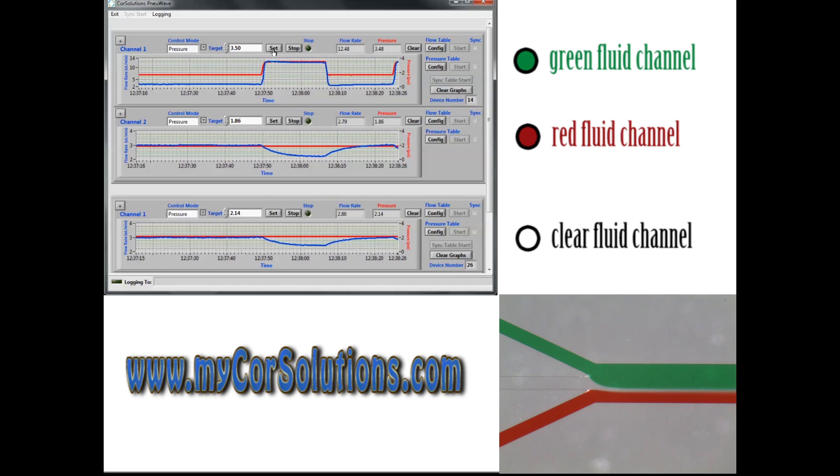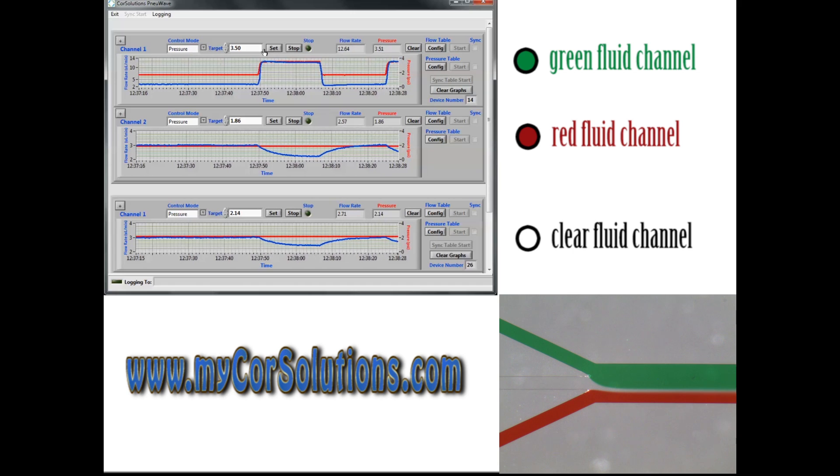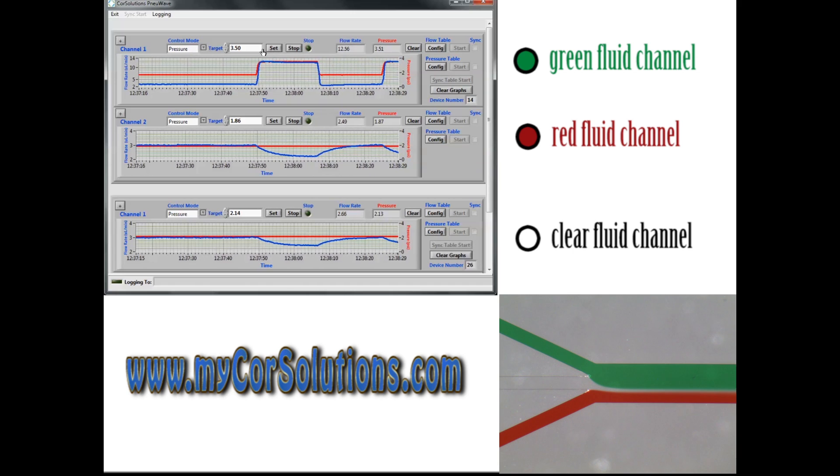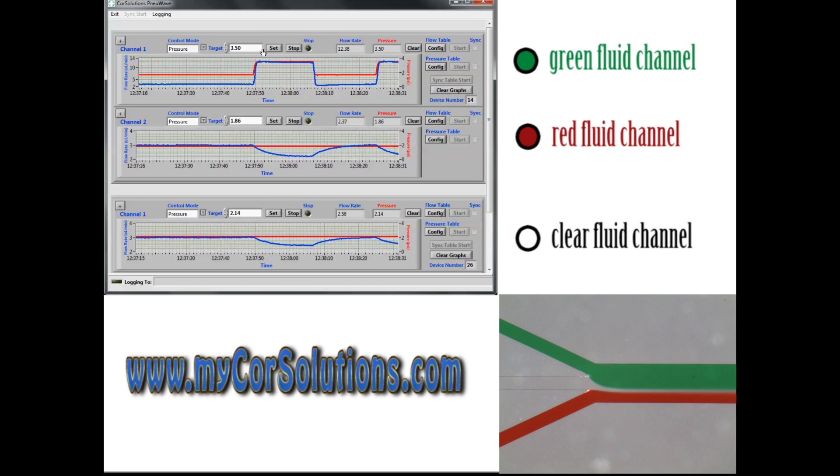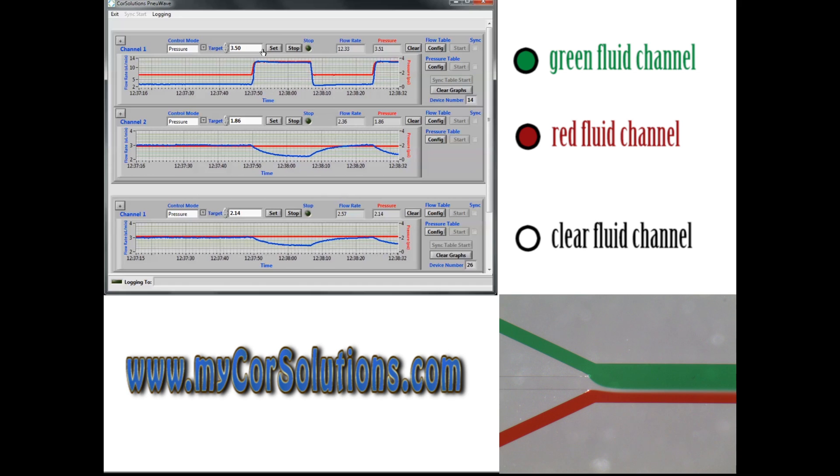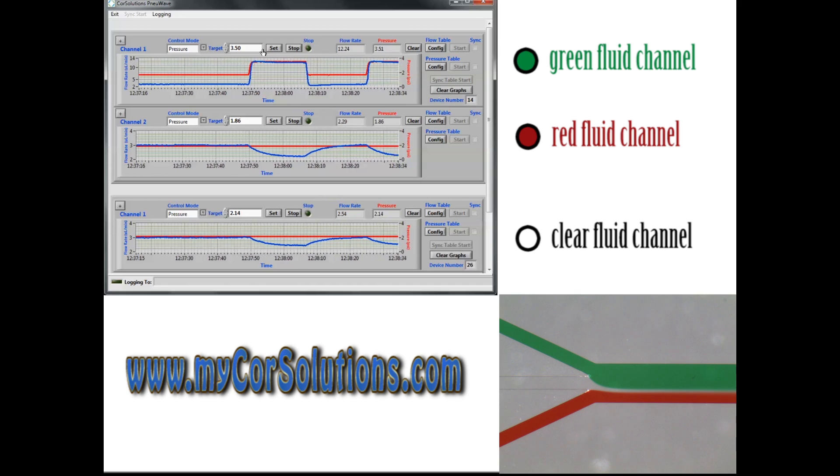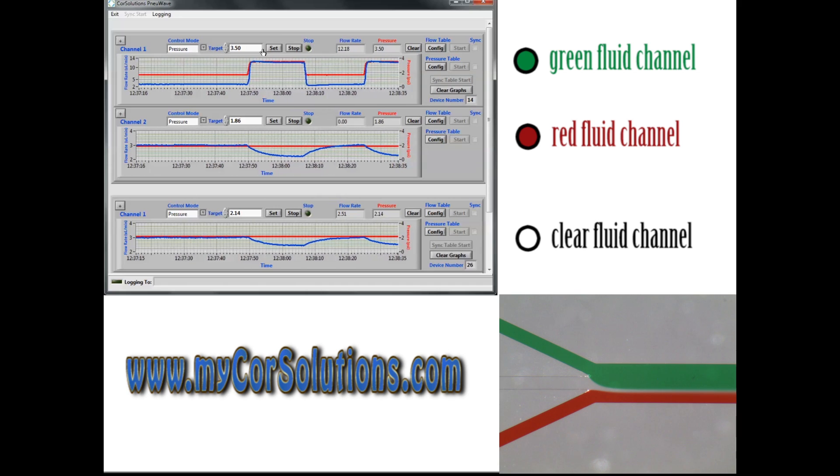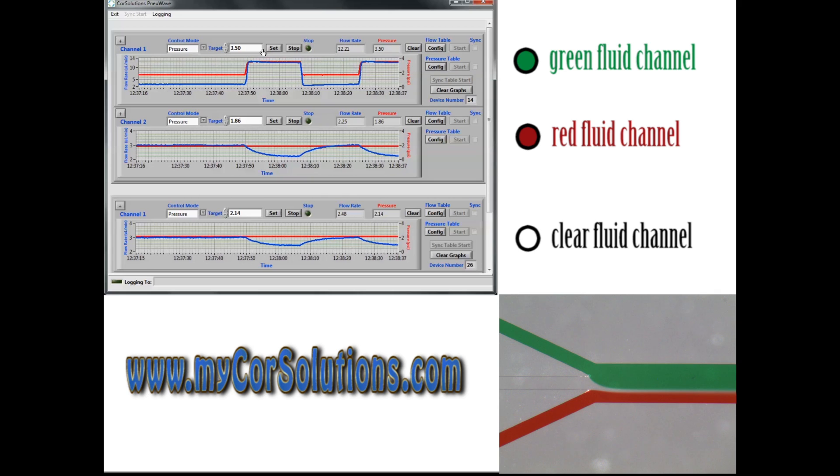However, the increase in pressure in the green channel also unexpectedly causes the flow rates for the red and clear channels to decrease by 20-25%, as shown in the blue lines of the bottom two plots.